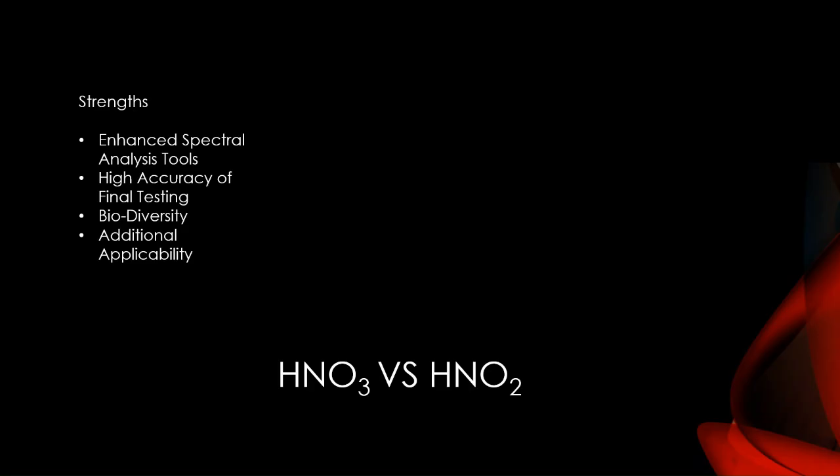This was proven through the 98.1% accuracy they got through third derivative analysis, and proved that was viable for differentiating samples of geographical origin. The Varimax rotation clarifies which spectral bands contribute most significantly to this variance, and geographic botanical diversity of the actual study itself shows that it may be applicable to even more medicinal plants beyond what the team tested.